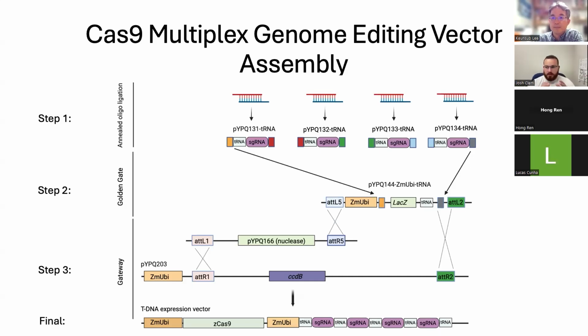So what I'll say is that ideally, yes, you would want to avoid using multiple copies of the same promoter and terminator set. However, most labs, including our lab, don't really follow that rule perfectly. It's very common for us to use multiple maize ubiquitin promoters and multiple NOS-T terminators. I wouldn't want to exceed 3 of them.